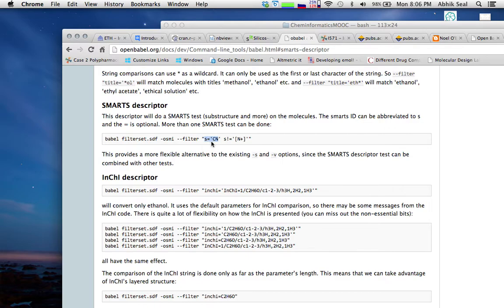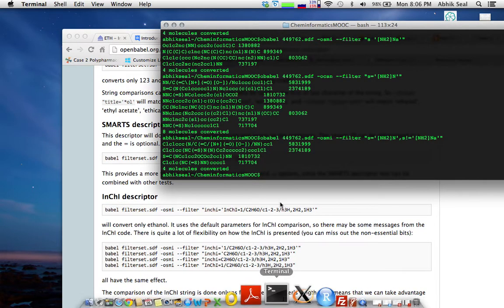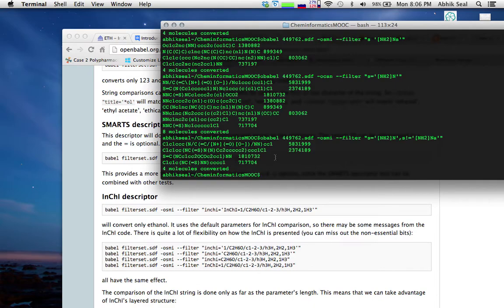The equals sign in the filter command is optional, just for better representation. In this example, the filter checks for cyanide ('CN') and nitrogen ('N+') — compounds that contain CN and not N+ will get filtered. In our assignment, I have already generated the SDF and SMILES format files, and you can output them using the '-o' flag.